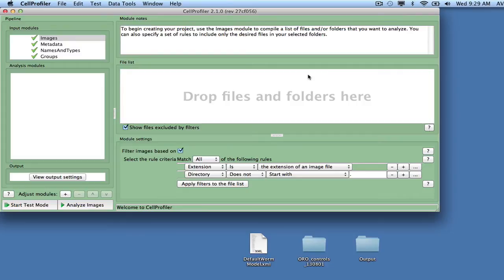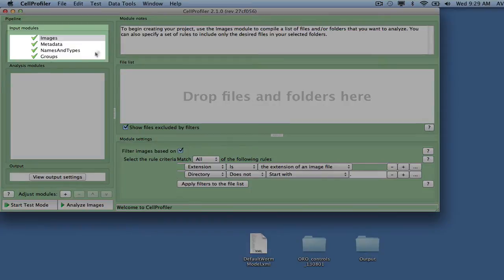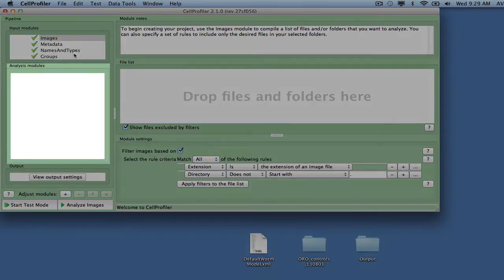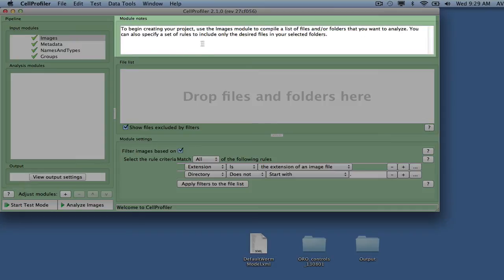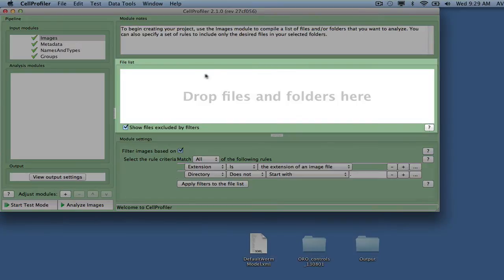The CellProfiler interface consists of the pipeline panel to the left, which is divided into input modules and analysis modules. A space for module notes for annotations and a file list will appear to the right.